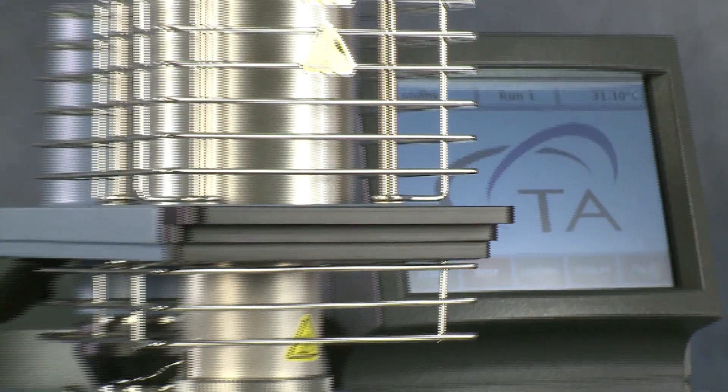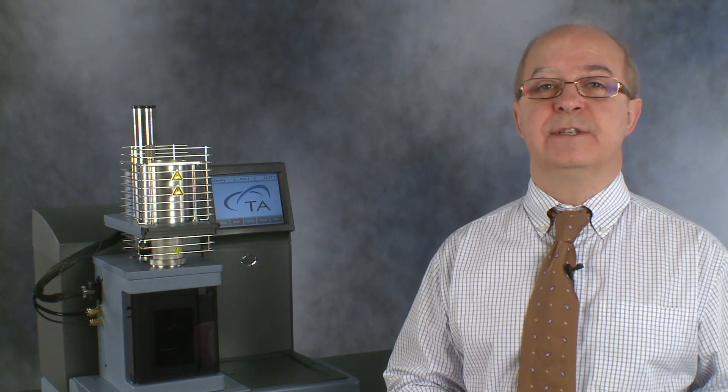For higher temperature applications, we also have dilatometers which can measure CTE up to 2800 degrees Celsius.